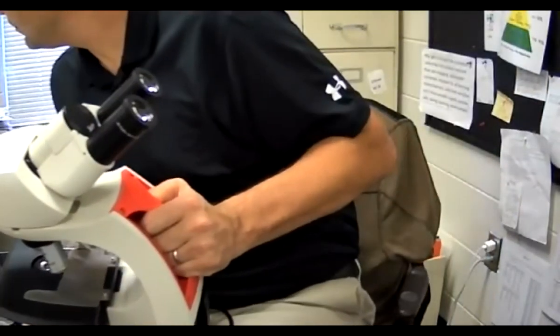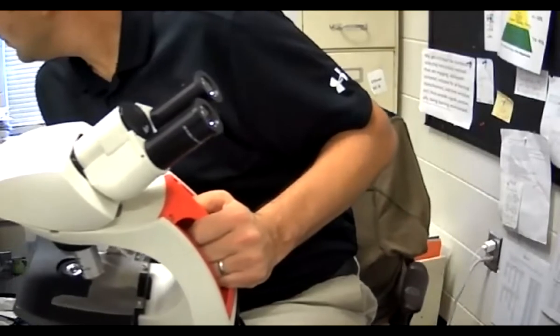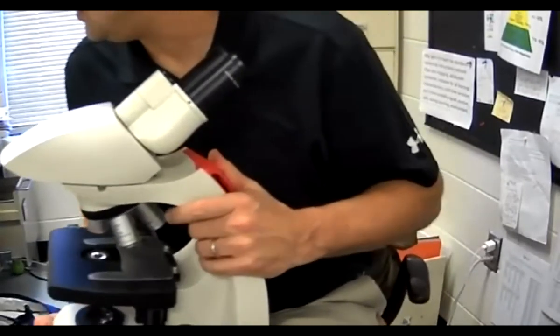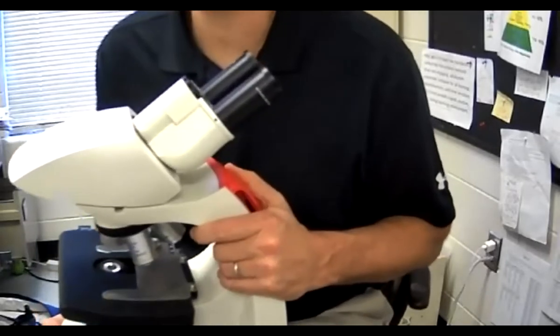It is on the sheet. So underneath the fine adjustment knobs are the stage knobs.